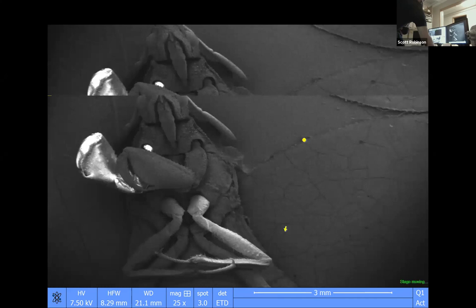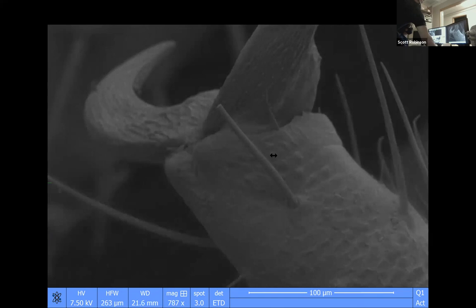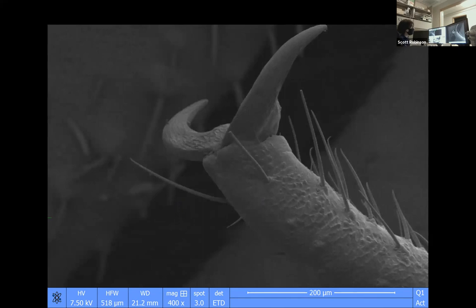Ah, look at that. So you can drive around to the little pieces, and then when you want to go to a higher mag, like you want to look at this little foot, we can double click to center it. We can bring that up. The right mouse button focuses, so now we've got a pretty good focus. And you can see one of its little hands.